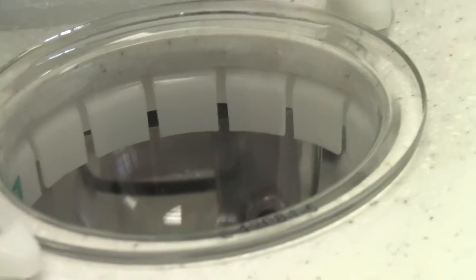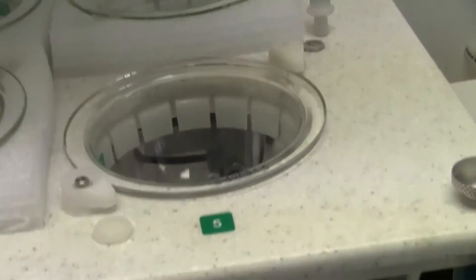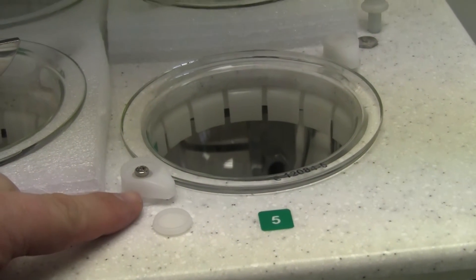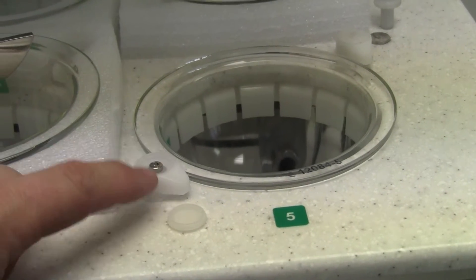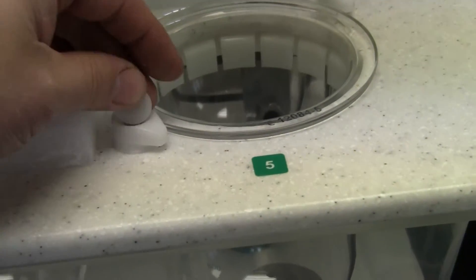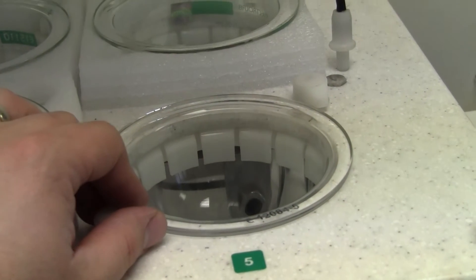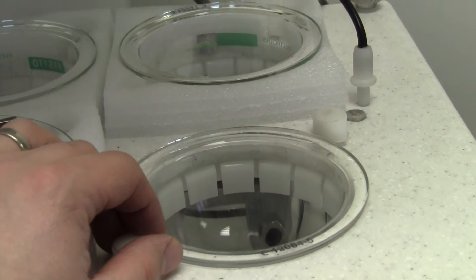Another convenient feature with this unit is that you can actually center the jar to the paddle. That's done with these clips. By loosening them, there's a procedure where you can then center the jar, then lock it down, providing a lot more stability and a lot more accuracy.